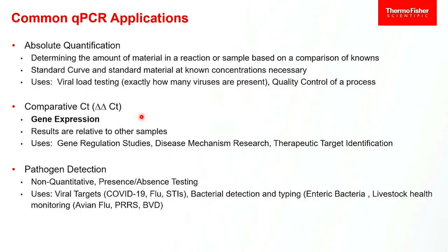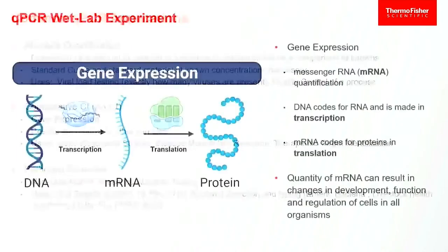Yes and no, and we're coming up to that. But I'll answer the question and then we'll revisit it when it comes up on slides. RT does stand for reverse transcription. So RT-qPCR takes the reverse transcription step and the qPCR step and does them together. So it's two actions at the same time. So that's the nomenclature difference. We'll talk about what reverse transcription is in just a second.